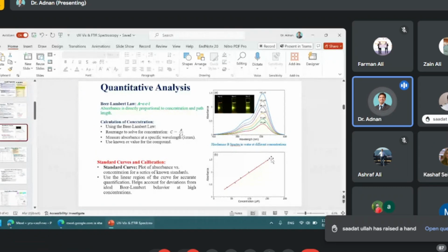So in this way you can draw the calibration graph again, and you can subtract the standard that you have added to them. Then they will be in the limit. Okay, you got it?